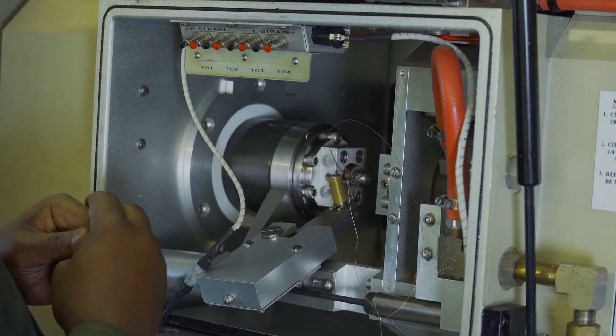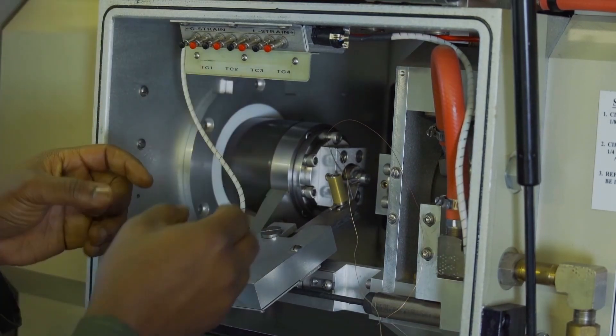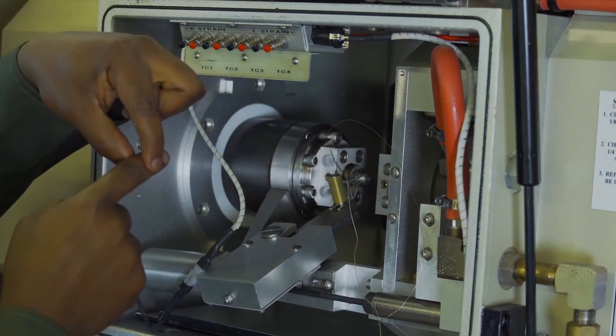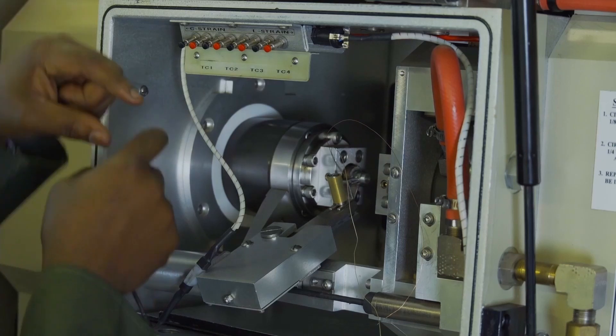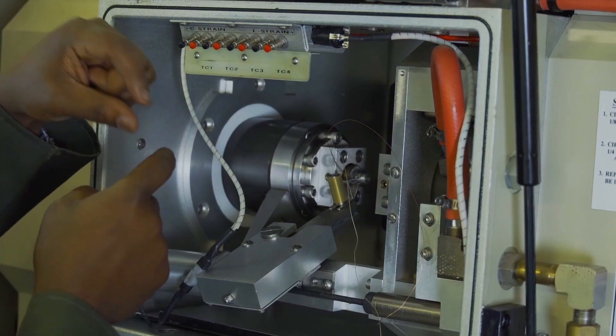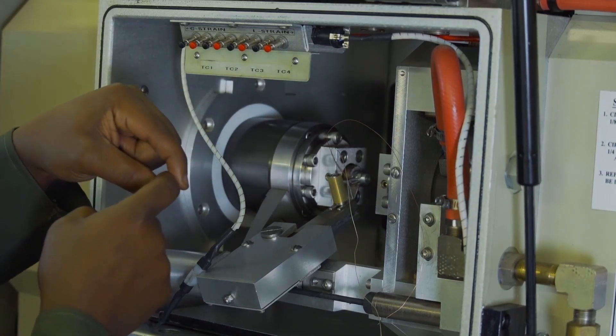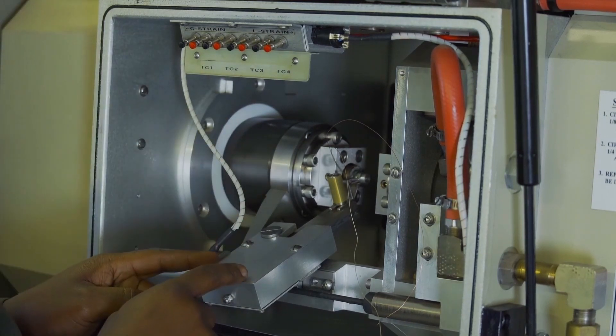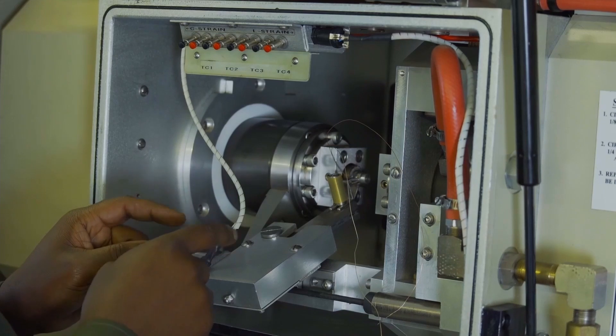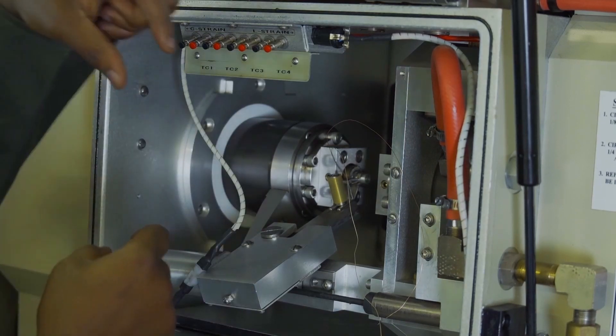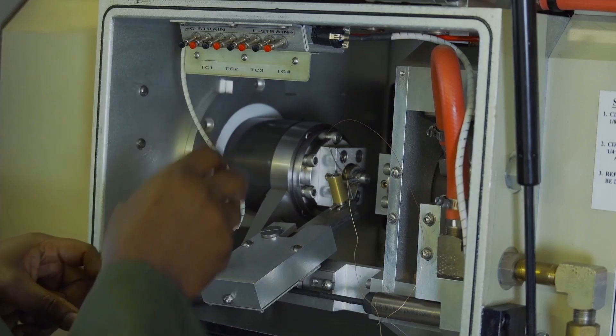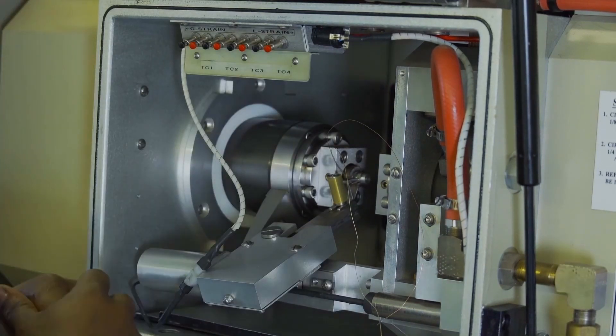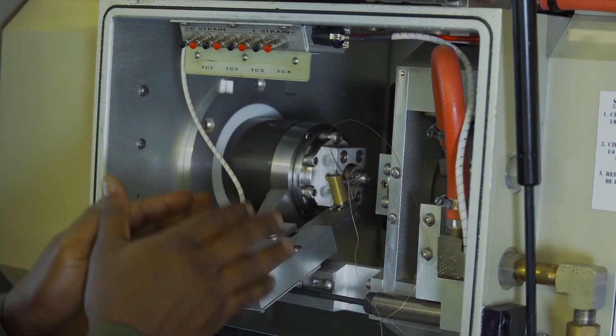It is designed such that as you're running the experiment, the anvils grip the sample, and once it grips the sample there is a certain amount of force that is exerted. That sends signals to the auto loader and the auto loader retracts itself while the sample remains in place. If the auto loader does not retract itself, you have to abort the experiment so as to preserve the life of the auto loader.